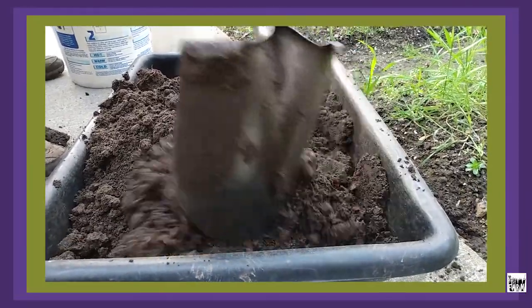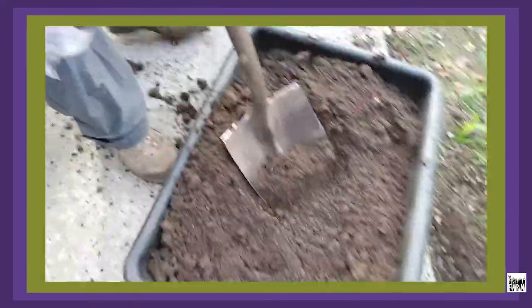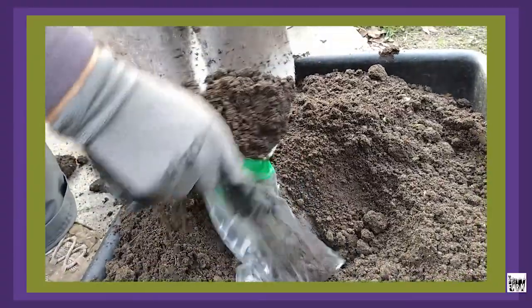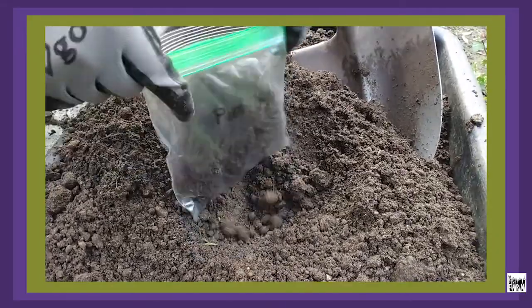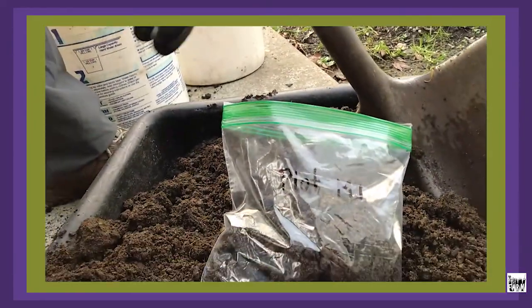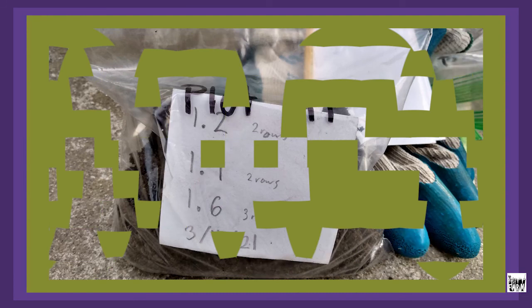Use the same testing service every year so you're not getting reports with different methodology. Each soil sample has at least two cups of material. I use a basic household sandwich bag or any kind of clean plastic bag — you can also use a paper bag. You also don't want your soil to be really wet and saturated; you want it to be maybe 50 percent moisture or less. Put the name of the beds on it and the date.